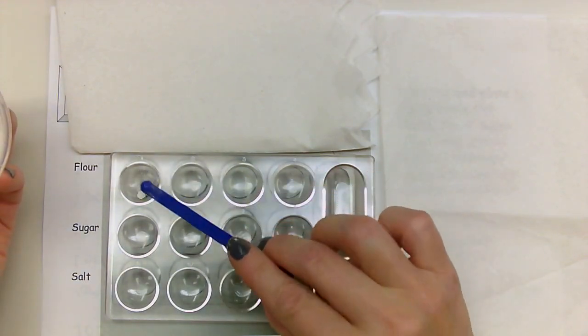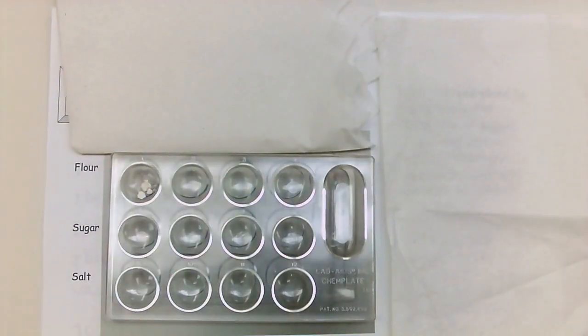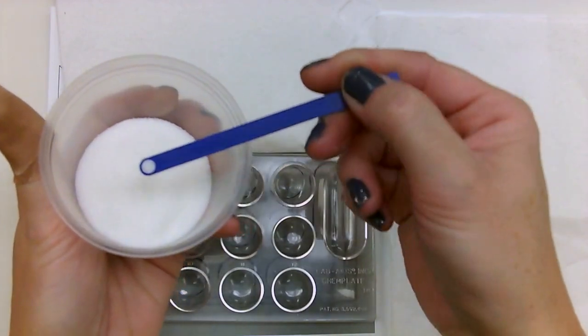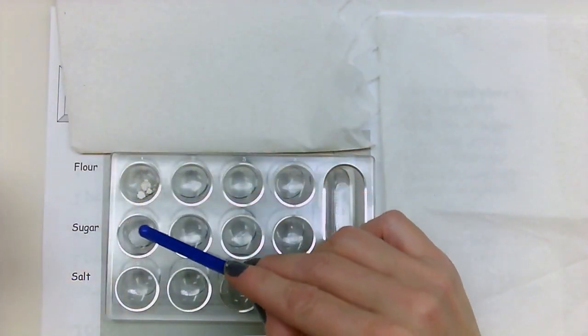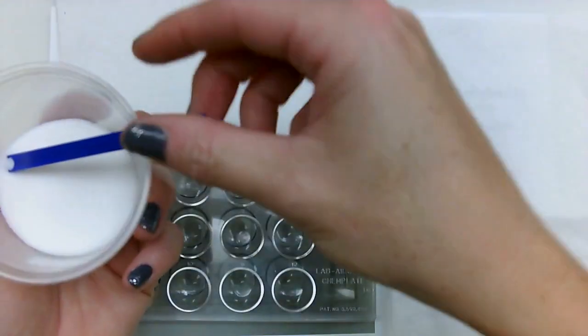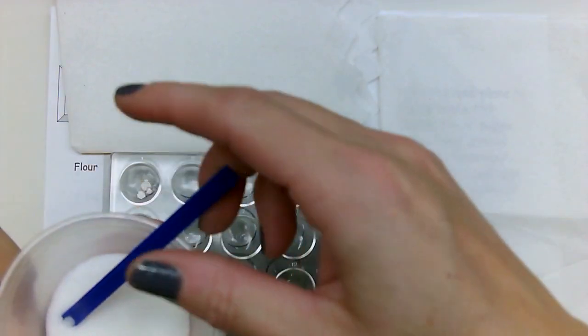Okay? And make sure it comes out. Okay, there we go. And then we are going to do a tiny little scoop of sugar. And this is just for the demonstration. Okay. And then a tiny little scoop of salt. Try not to spill these as you collect them, okay?